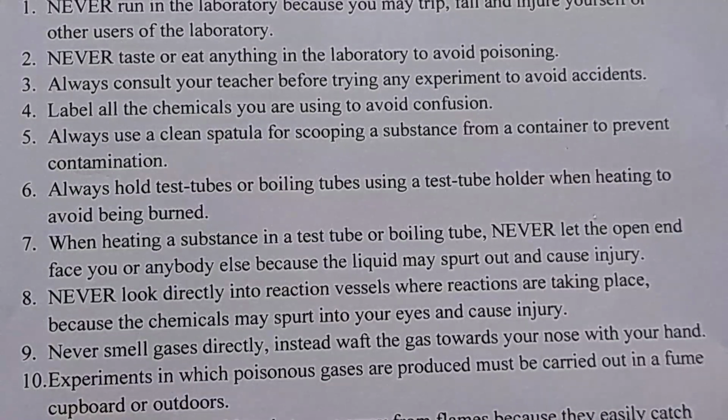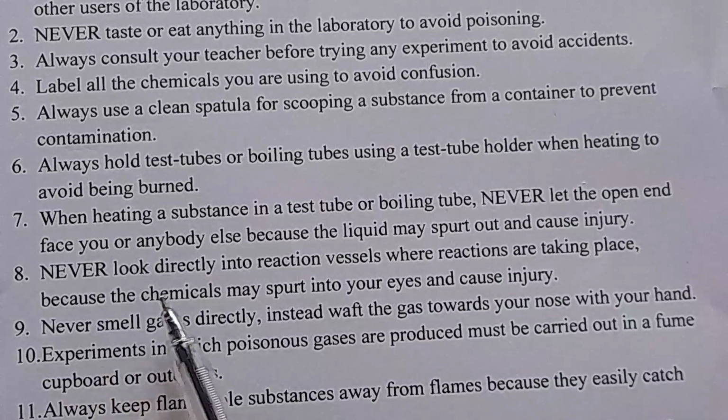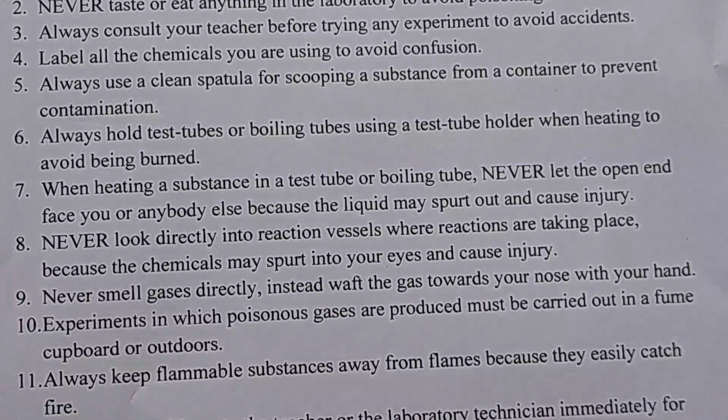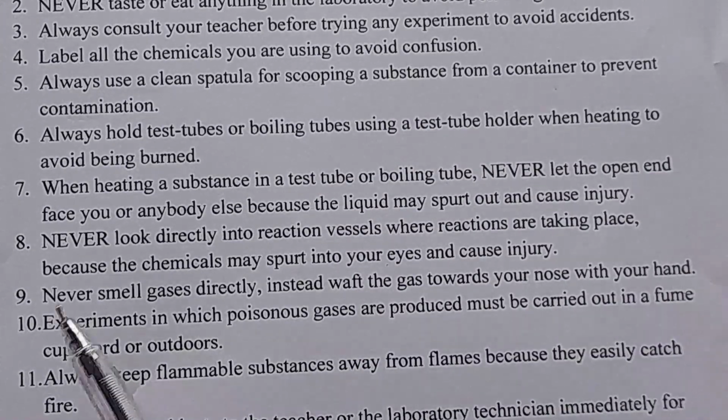Then number eight, never look directly into reaction vessels where reactions are taking place, because the chemicals may spurt into your eyes and cause injury. Okay, number nine, you are told never smell gases directly. Instead, you are supposed to waft the gas towards your nose with your hand.